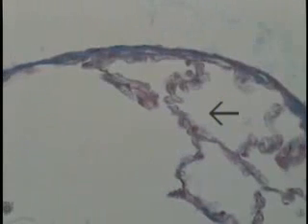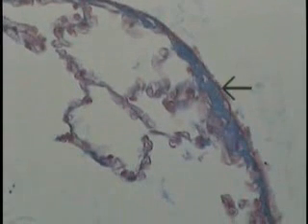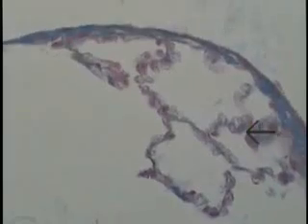Obviously also contained within this connective tissue are going to be elastic fibers, which aren't demonstrated, as well as a delicate network of reticular fibers. So this is the pleura of the lung, the visceral pleura lining or covering its external surface.